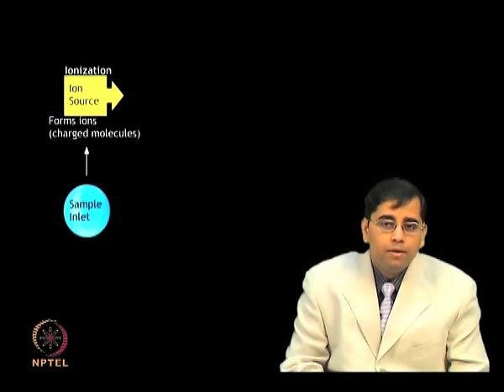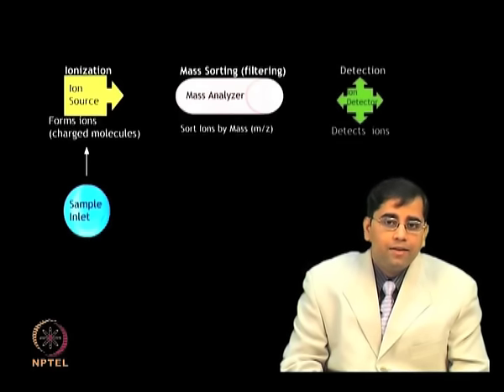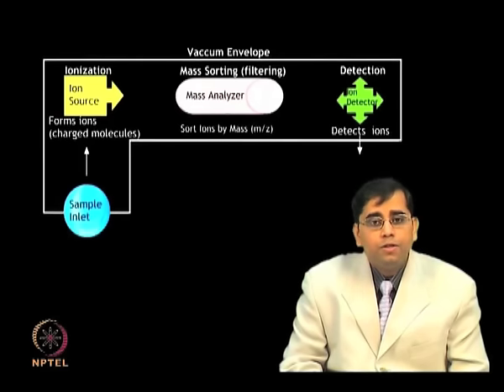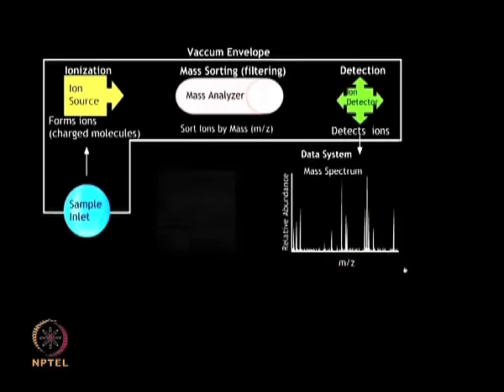The basic components of mass spectrometry involve a sample inlet to transfer sample into the ion source, an ionization source which converts neutral sample molecules into gas phase ions, a mass analyzer to separate and analyze the mass of ionic species, a detector which measures and amplifies the ion current of mass resolved ions, and a data system to process and analyze data.